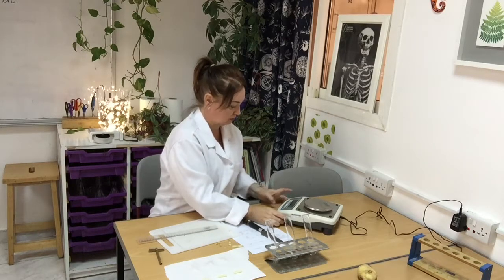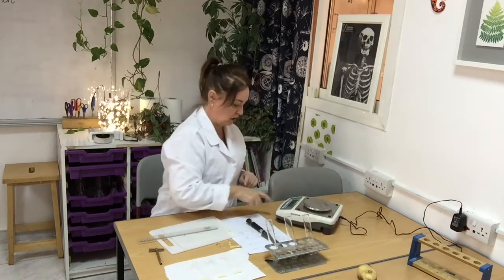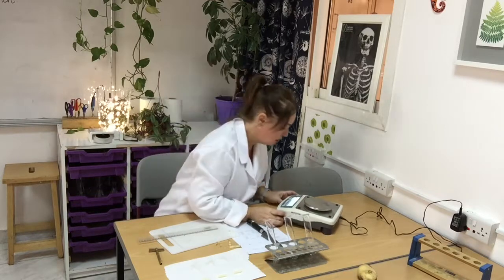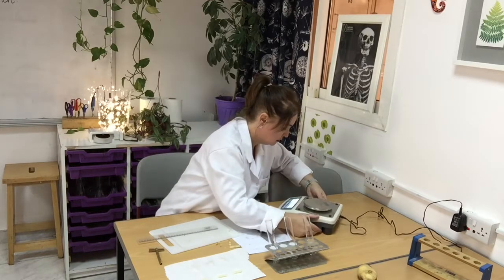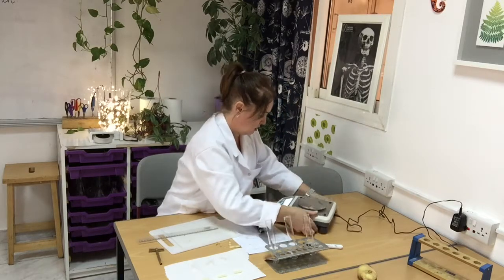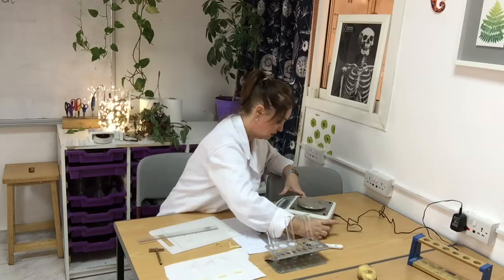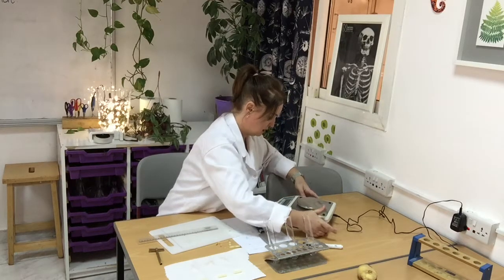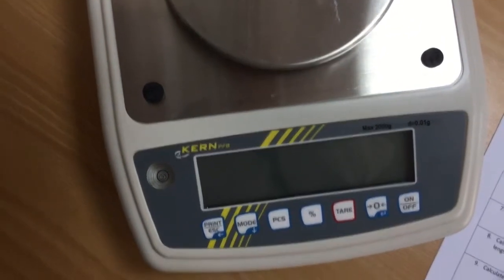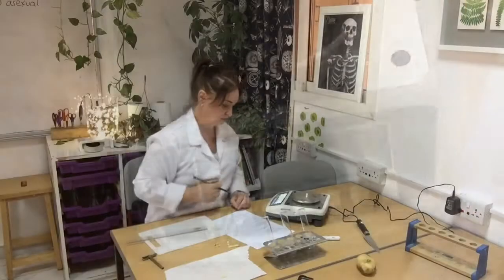Okay, so now I need to organise my digital balance. I'm doing that by adjusting the feet on the bottom, and I want to make sure that the air bubble is centred. And the only way I can do that is by looking at it from an aerial position. And as you do that, you'll see it pop into the centre, and that means that the digital balance is level and will therefore measure the mass accurately. So here to the left of the digital display, you can see a little air bubble, and when you move over the top of it, you can see that the air bubble is in the middle.